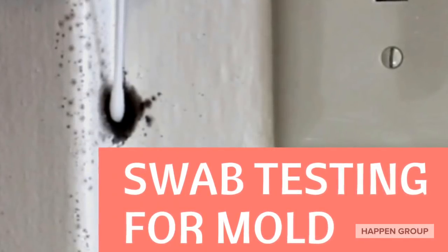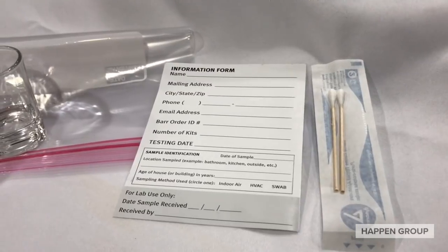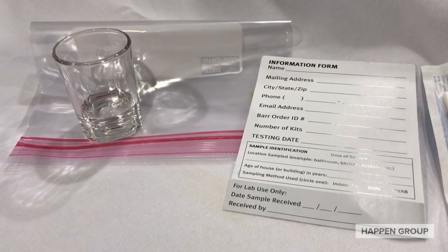Hey, this is Nick with the Happen Group. Today I'm going to show you how to do a swab test for mold. You will need the following items: sterile Q-tips, information card, and a ziplock bag.